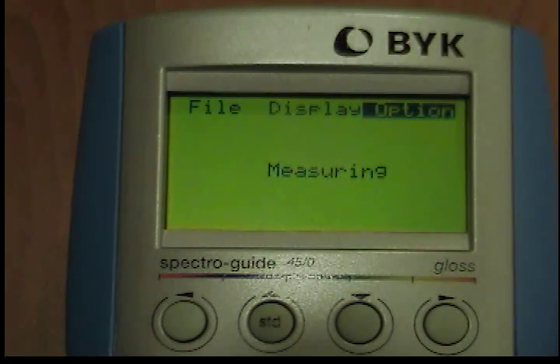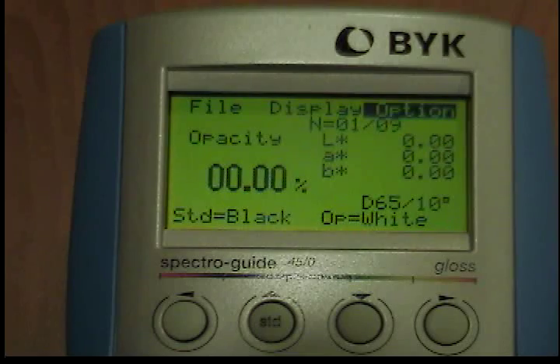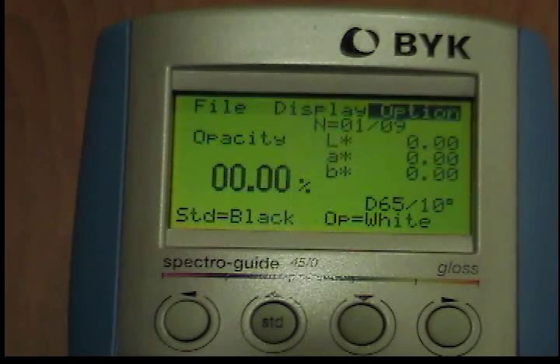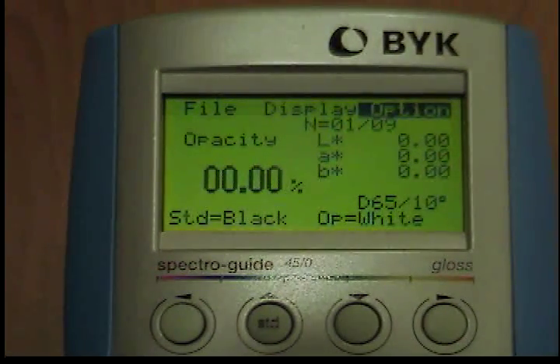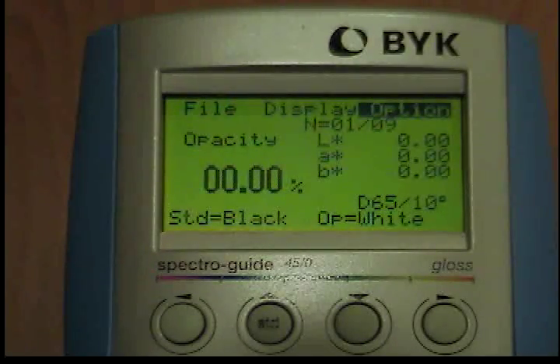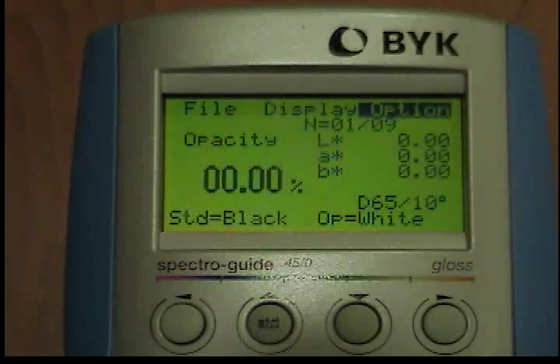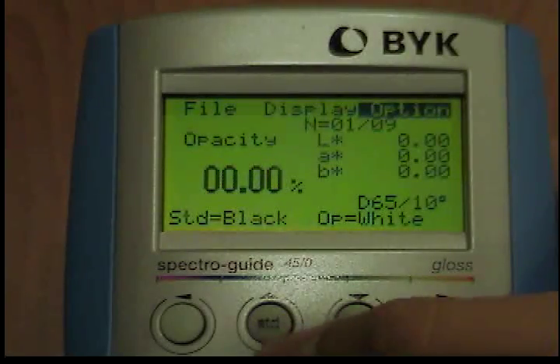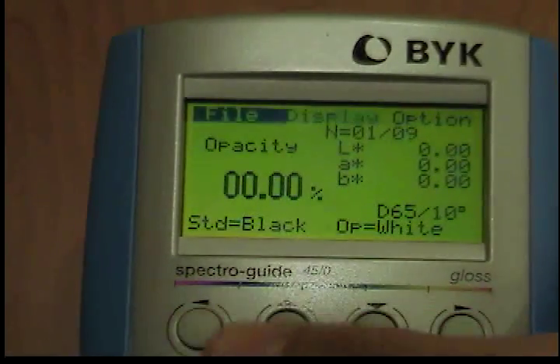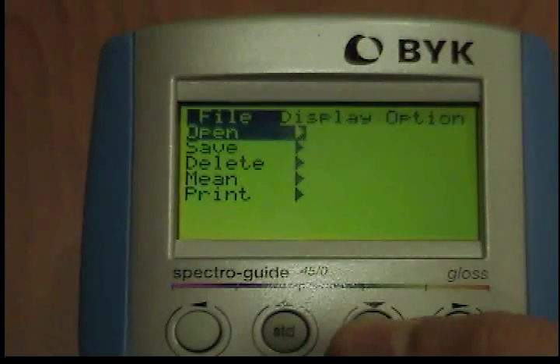Then use the operate button to measure the sample against a white background. After measuring with the standard button, the opacity is zero. The L*, A*, and B* values for the sample against the black background are displayed on the right side. After the measurement has been performed with the operate button, the opacity and delta values between the measurement against the black and white backgrounds are displayed. If you choose to store the reading with the FileSaveSample function, only the reading against the white background is stored. However, sample against white background and opacity can be printed.